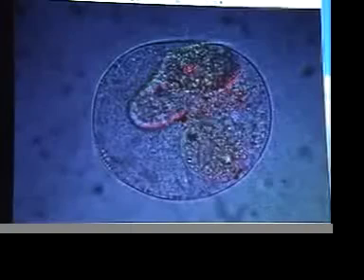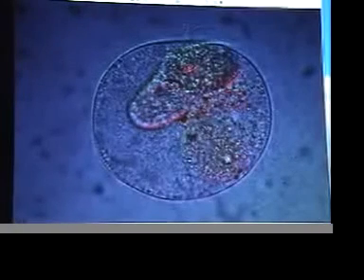There's a beautiful color. Hopefully that shows up on your video as beautiful as it is here in the lab. By the way, you can tell this is not thermal because you can see other small organisms swimming by. See if any other organisms were affected during this period.